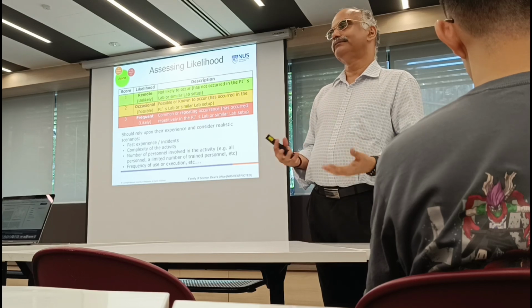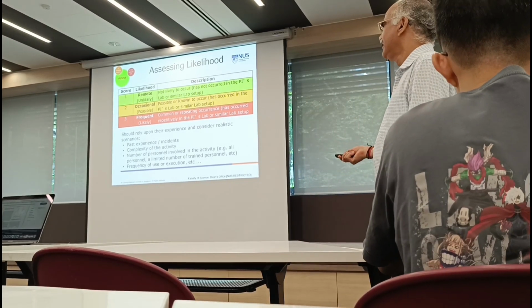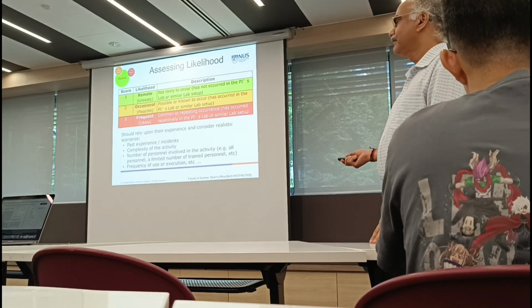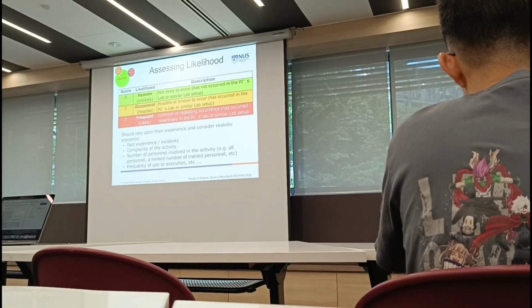So in a normal sense, the complexity may not be that high. Then the number of personnel involved in the activity, again, if you are working alone, then it probably has a factor, right, as compared to multiple people working together.